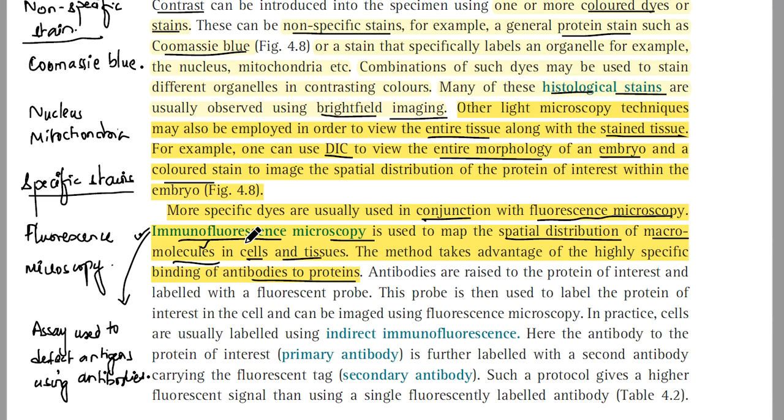and this is known as fluorescence. Now, in an immunofluorescent test, the fluorescent dye which illuminates in UV light, that means it is excited in UV light, is used to detect or show the specific combination of an antigen and antibody.